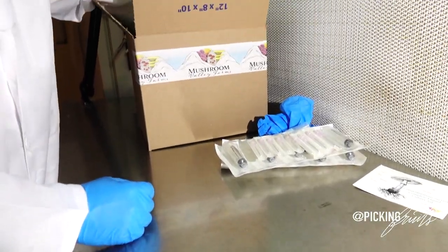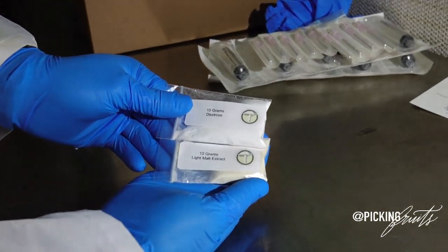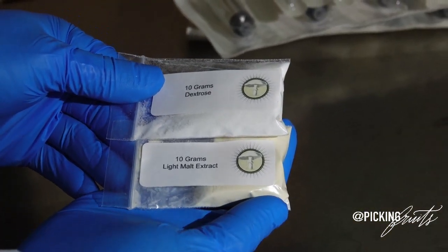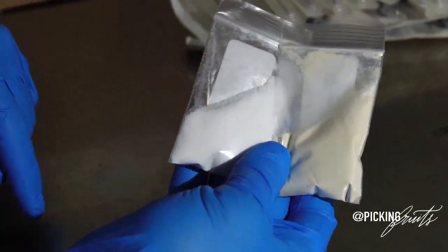The next thing in your kit will be nutrients. You will find 10 grams of dextrose, 10 grams of light malt extract, and this amount of nutrient here will be enough for 2,000 milliliters of liquid culture.